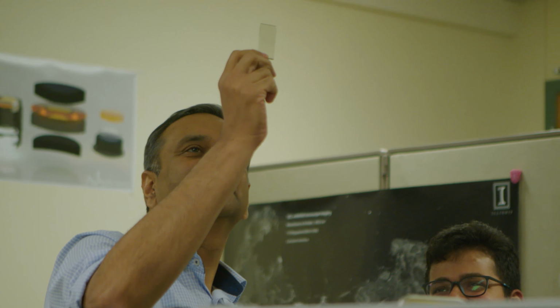So initially, we've been able to not only label particular molecules with the MinFlux instrument, but track them over time with nanometer scale precision. So the resolution is about 2 nanometers, and in 3 dimensions, we can track individual molecules, not only where they are and how many there are, but also how they function. We've been able to obtain much higher resolution images than have ever been recorded.